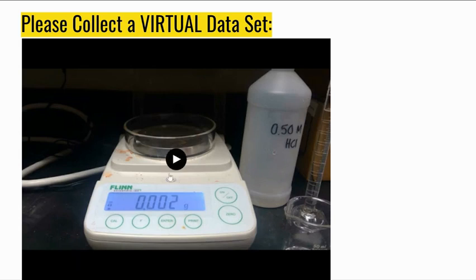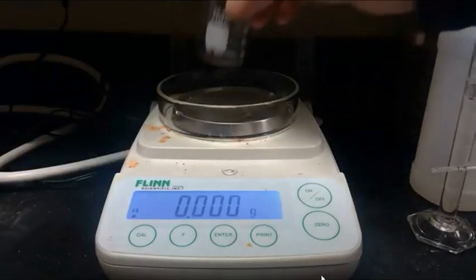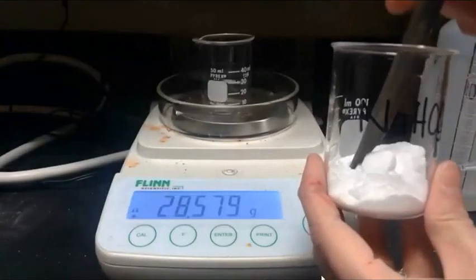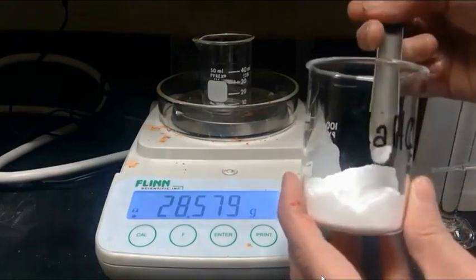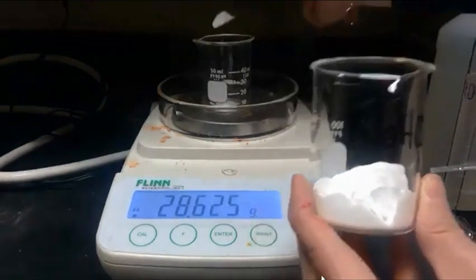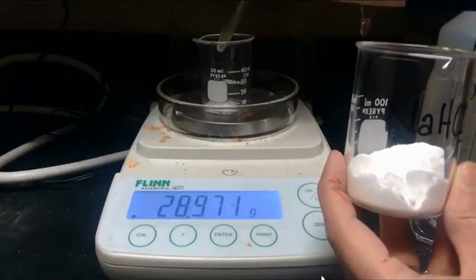All right, let's take a second and have you collect a virtual data set. Please record the mass of the empty beaker. Now we're going to add exactly 1 gram of sodium hydrogen carbonate, baking soda, and you'll need to record the mass of the beaker with the baking soda added.